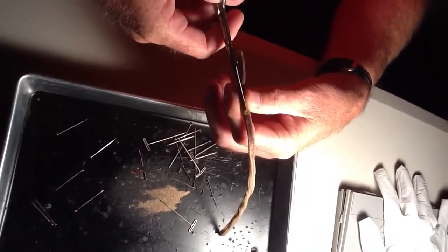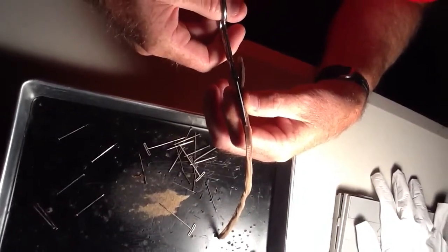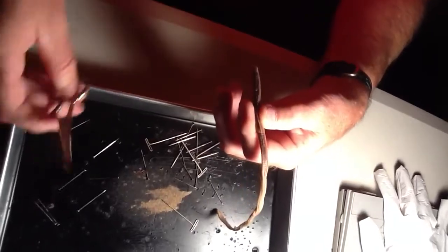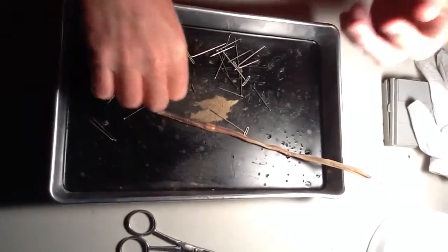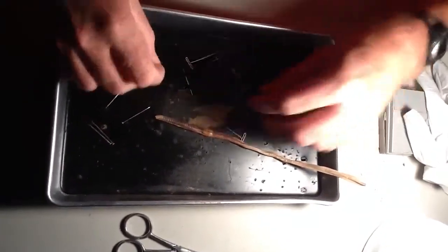And I'm going to get down. All you have to do is go down to about a half-inch past the clitellum. And that's it, all right? All the rest is the same. You can do the rest, just a waste of your time, waste of your effort there.